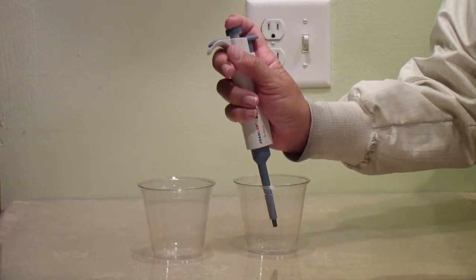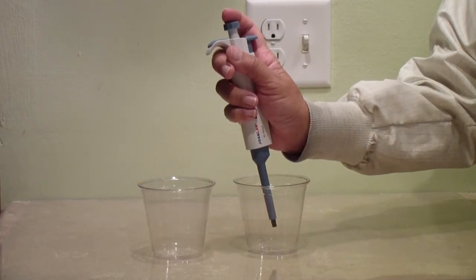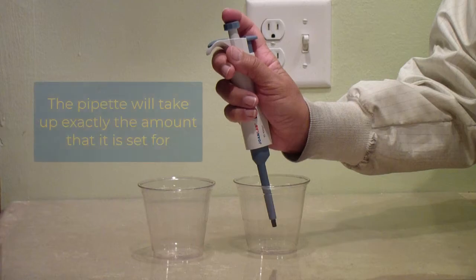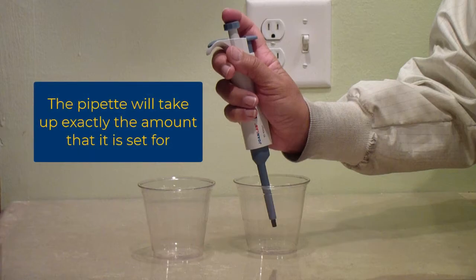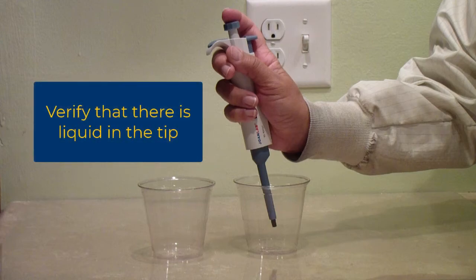Now gently guide the plunger upward, releasing it. The action of the pipette will suck exactly 90 microliters of your imaginary liquid into the tip. Normally you would look at the tip to visually verify that the liquid is in there.